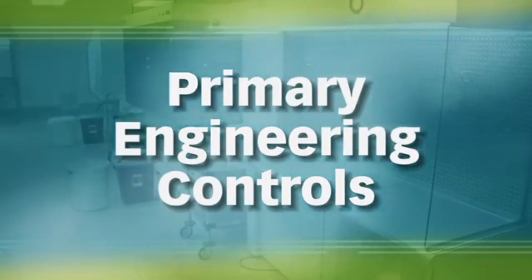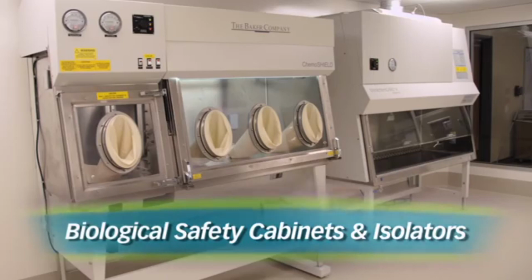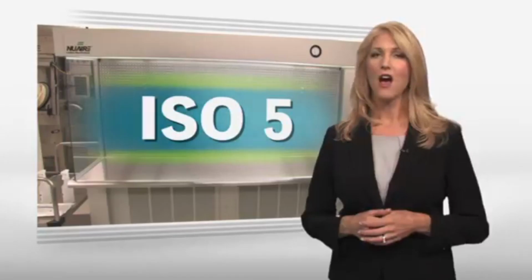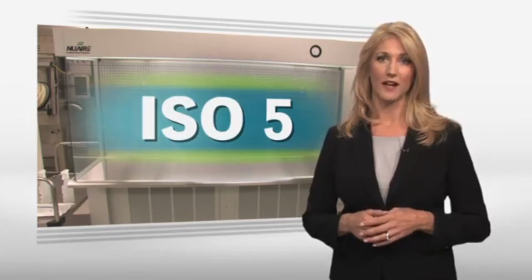Primary engineering controls include horizontal and vertical airflow workbenches, biological safety cabinets, and isolators. In most cases, facilities use a laminar airflow workbench to provide the environment for critical sites. All of the primary engineering controls are designed to maintain an air quality of ISO 5.